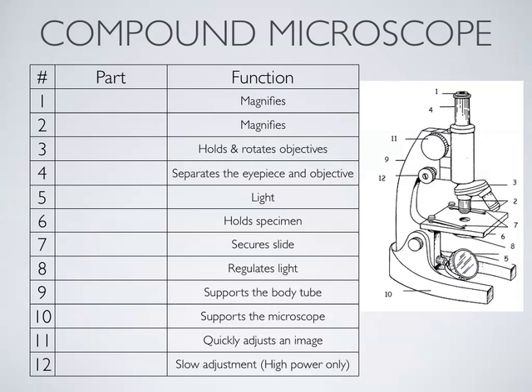Probably not. All right, so let's talk about this compound microscope. We need to learn how to use it, and we need to learn what the parts are. In fact, you're going to have a quiz next week on the parts of a compound microscope. So I'll show you on the actual microscope. We'll fill some things in here.